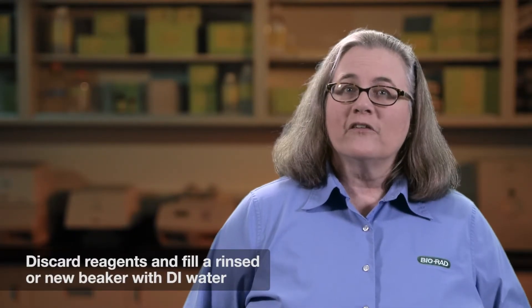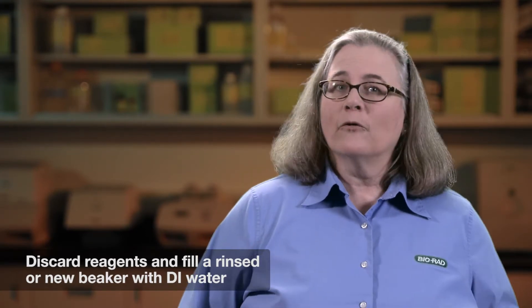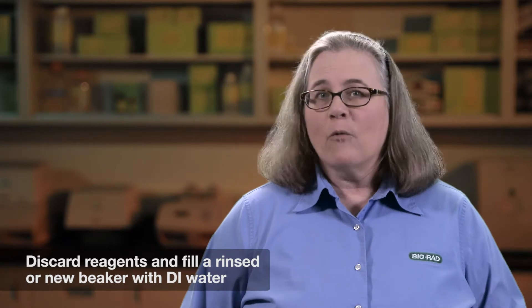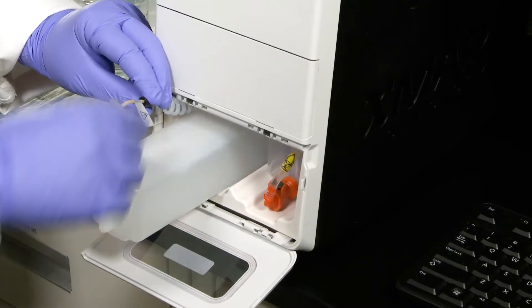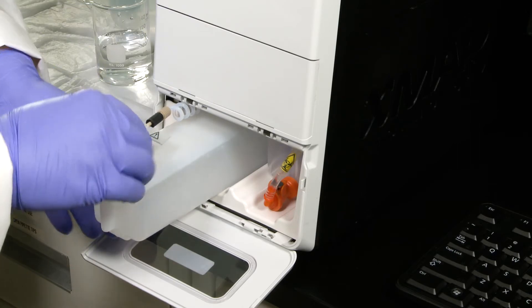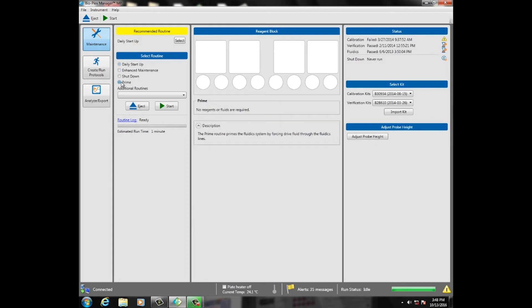Discard the reagents from the disposable reservoir and fill a rinsed or new beaker or reservoir with DI water and repeat the prime routine 10 more times. This procedure will take about 20 minutes to complete. Place the drive probe back into the drive bottle container. In the software, select the prime routine 3 times to prime the instrument with drive fluid.